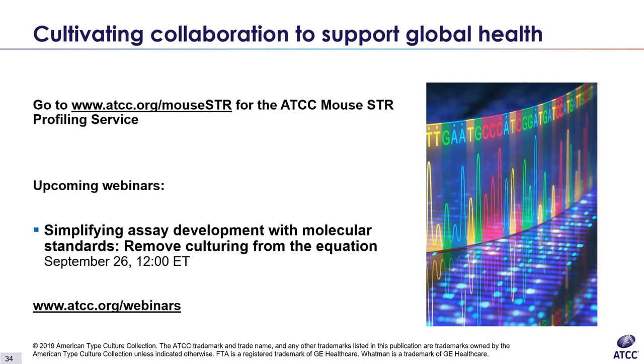All right, I see. Okay, Balsam. You made the point a couple of times in the webinar on the importance of mixing the sample, whether it's cells or DNA, before spotting them on the FTA paper. Why is that?